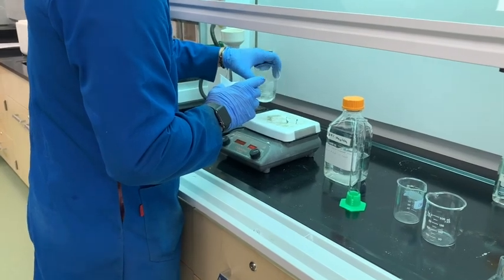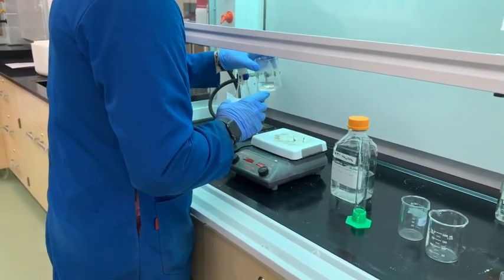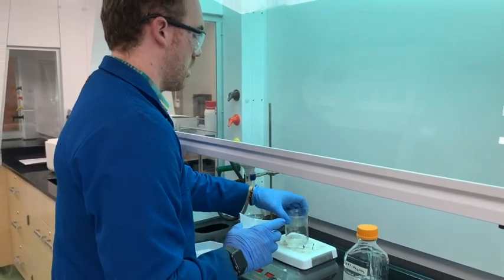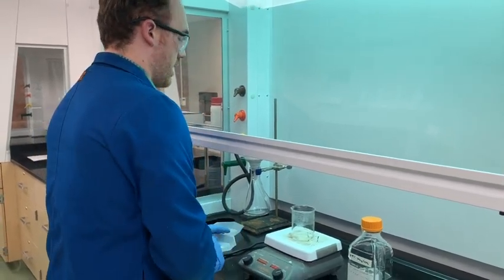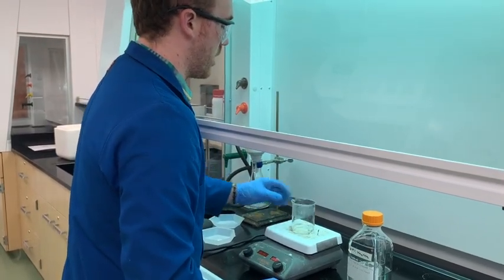So make sure you give this a stir. Looks like it's still dissolving a little bit. So you want to make sure you let everything heat to fully dissolve before you go to the next step. So we're going to call a couple minutes on that one.